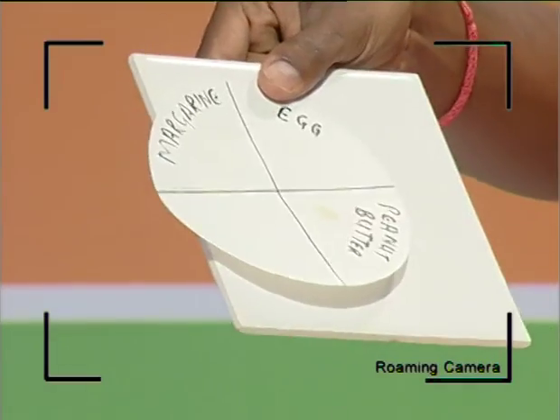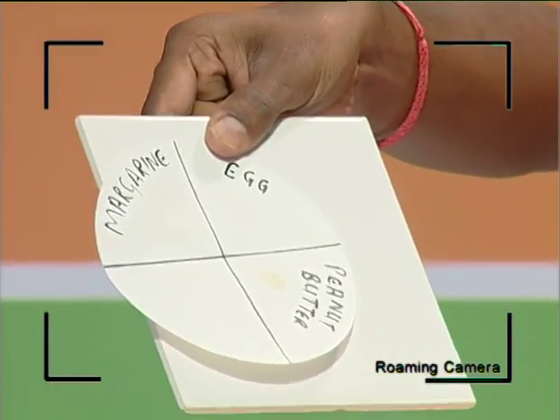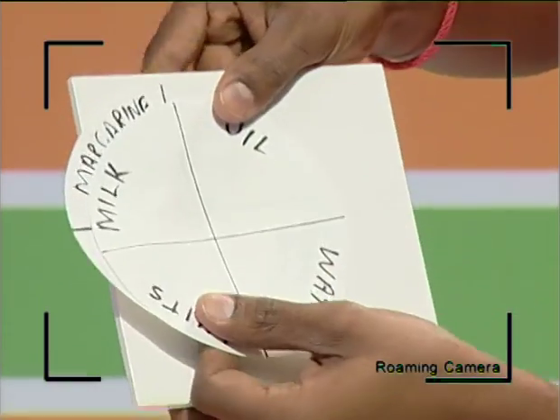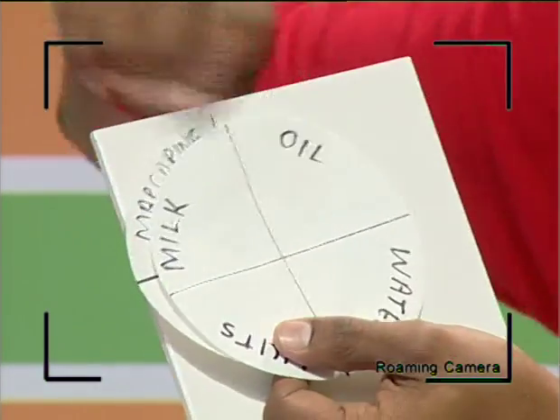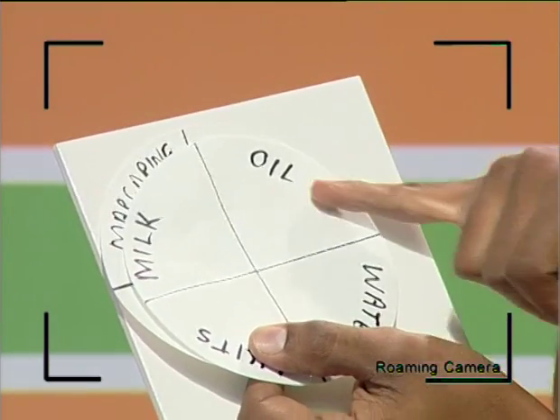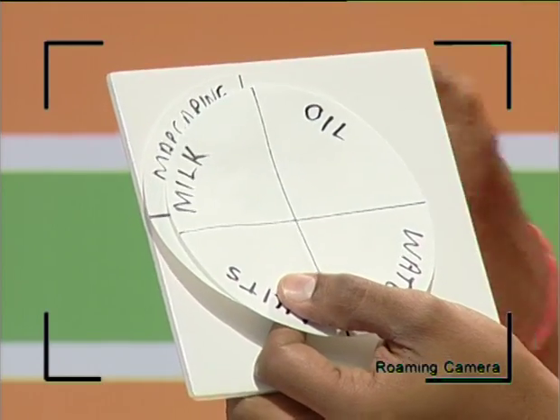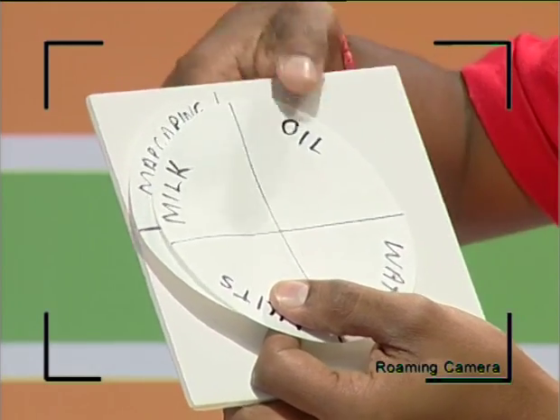We're going to look at our positive controls. I'm going to move this over. So we had oil. Okay, so there's oil here, guys. If you look at oil, you can clearly see a little water mark there, and actually it's an oil stain, and that indicates the presence of oil, or the presence of lipids in the oil sample.